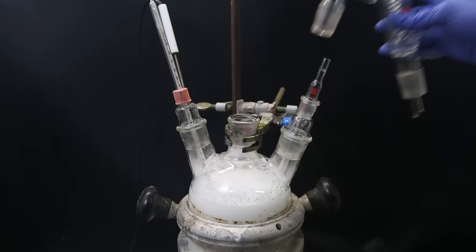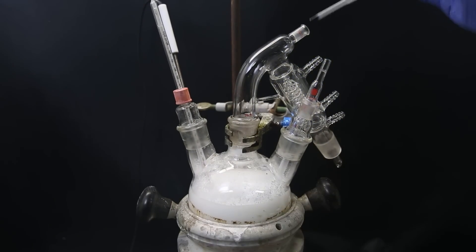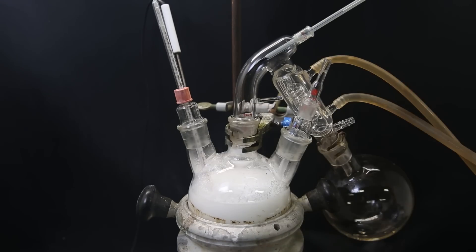I then remove the funnel and attach a short path distillation apparatus, but a regular distillation setup is also fine. I also just use a slightly dirty receiving flask, which is also not a problem. I already started heating the mixture and set the temperature of the mantle to 150°C.